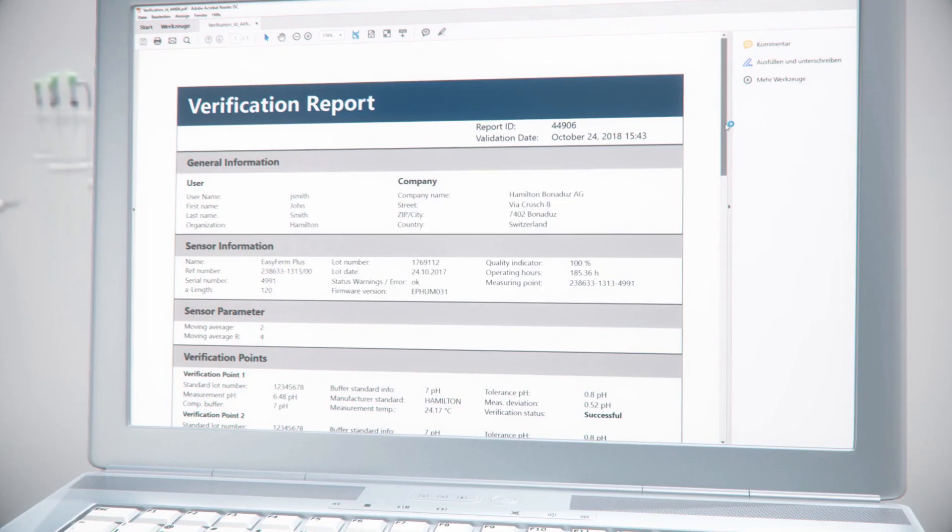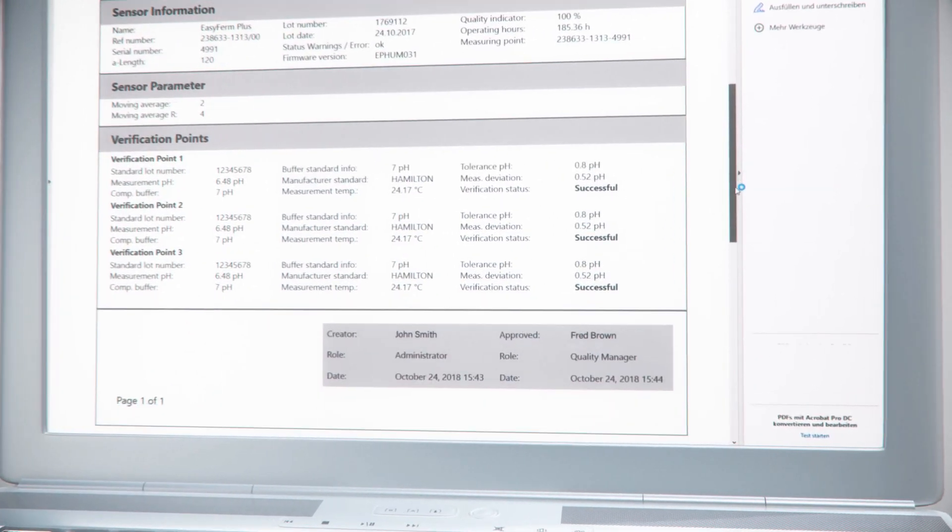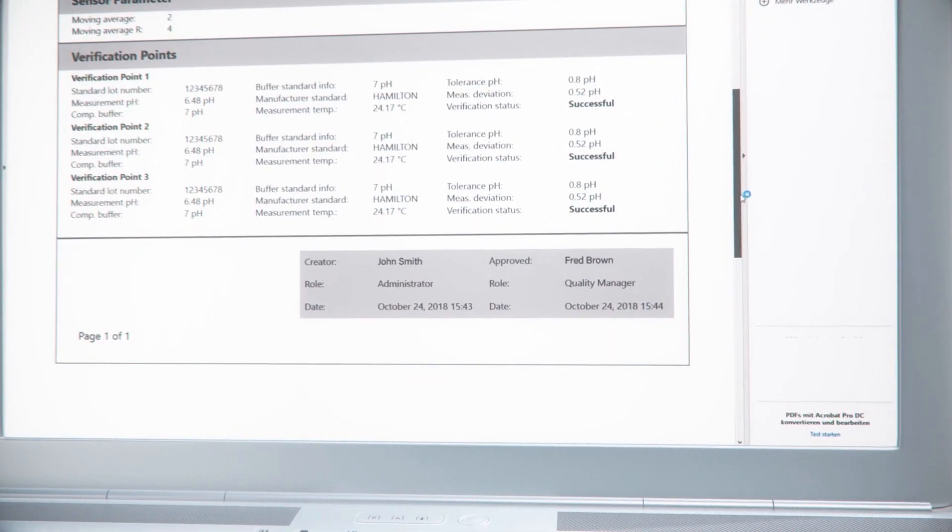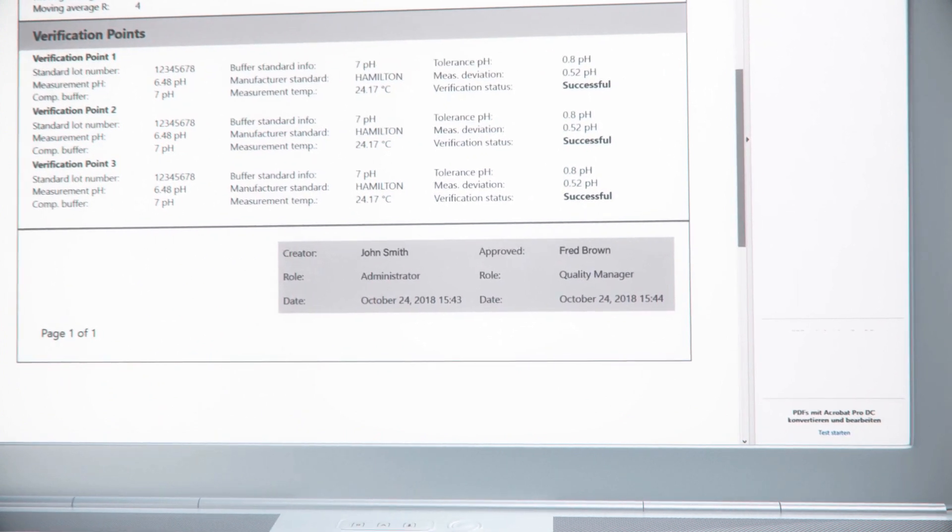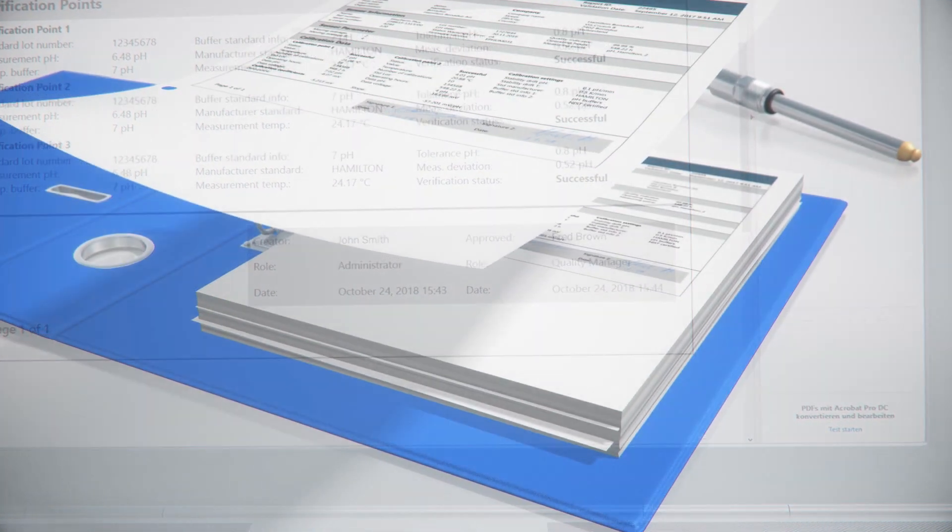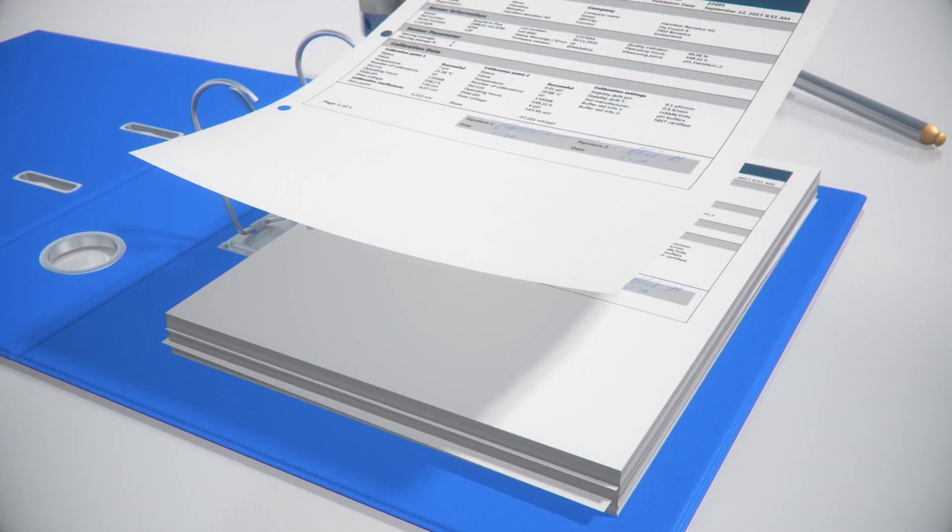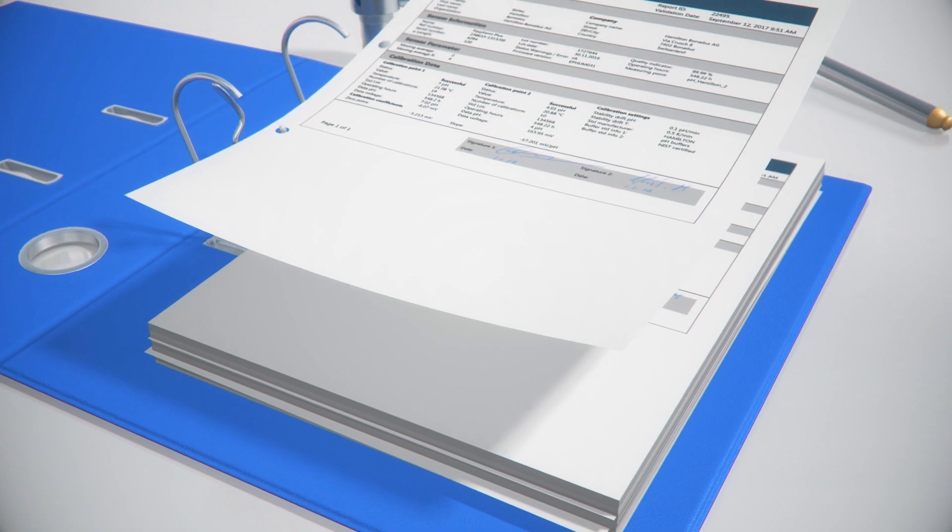A PDF copy of the report is also saved automatically in a folder predefined by the user. Alternatively, the reports can be printed for sign-off.